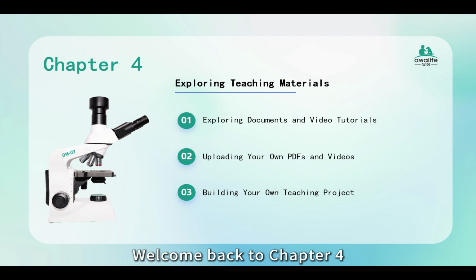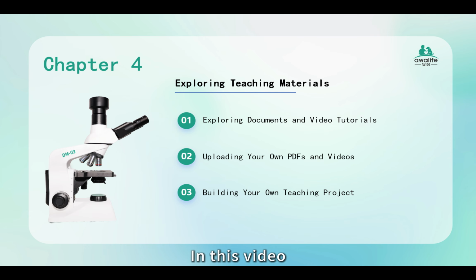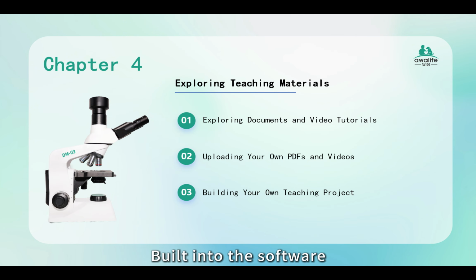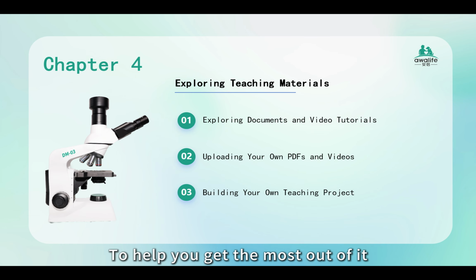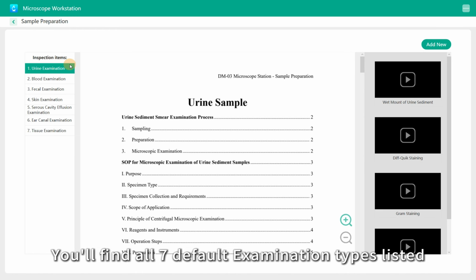Hey folks! Welcome back to Chapter 4 of our DM-03 Microscope Workstation tutorial series. In this video, we are going to explore the teaching materials built into the software. The DM-03 software comes packed with a rich library of resources to help you get the most out of it. On the main dashboard, click Sample Preparation. Here, you will find all 7 default examination types listed.